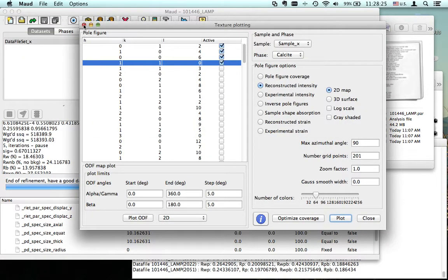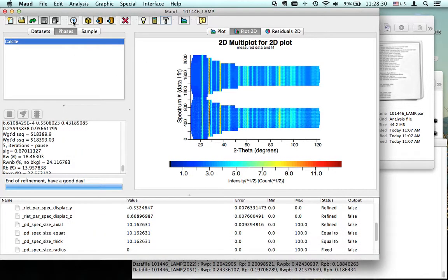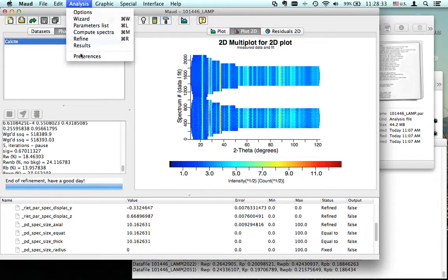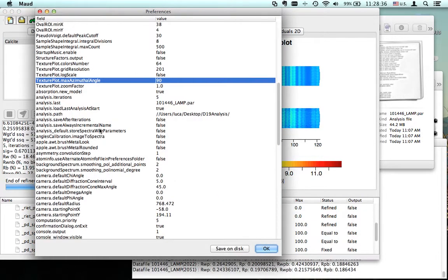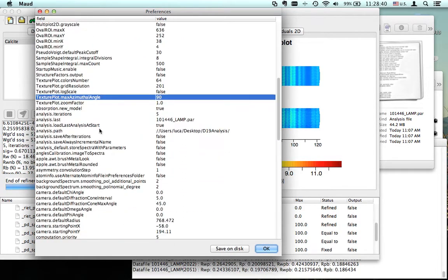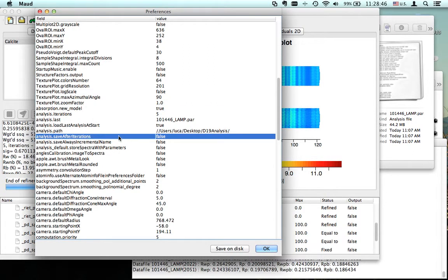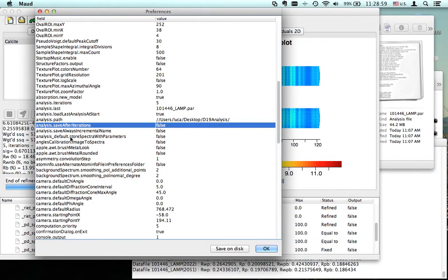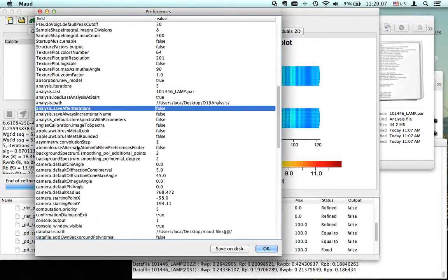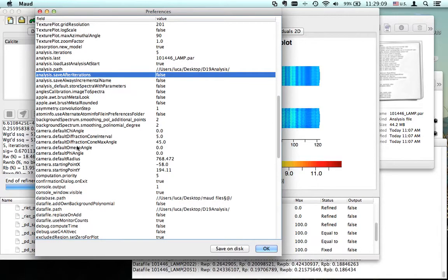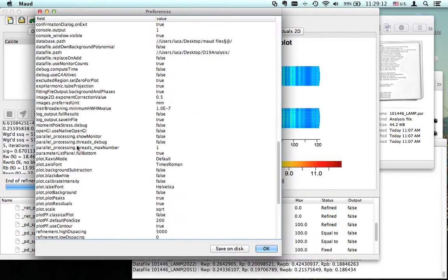We have two poles over here in the sample. This is our texture. If we want to check now, let's see first in the preferences. In analysis, iteration save after iteration—this one is false. If you put this one to true, after every iteration MAUD will save a file.